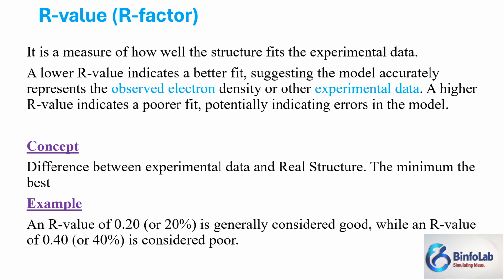First of all, go for the one that covers the majority of the sequence area. For example, if one structure is for 10 amino acids and the other is for 30 amino acids, I think the one with 30 amino acids is far better. The second thing is you should know whether it is experimentally resolved, so check the method section. The third thing, check the resolution. If it's 2 or below 2, that's better and you can safely select it.